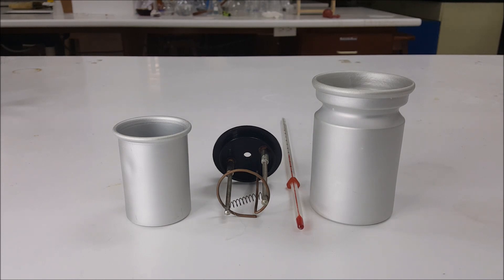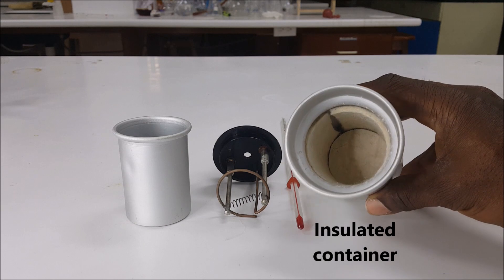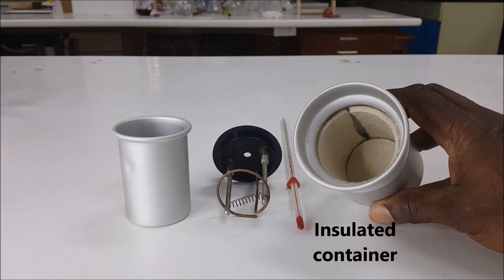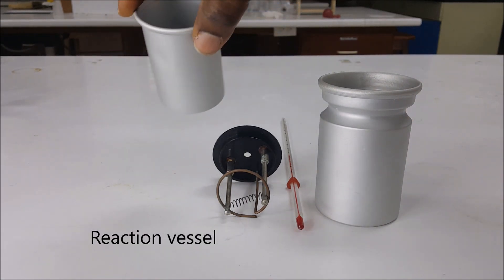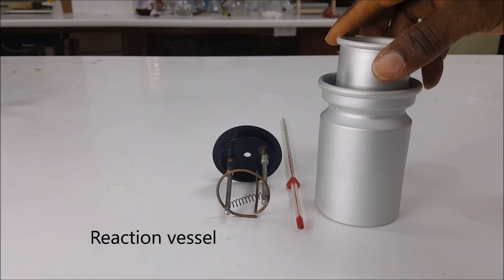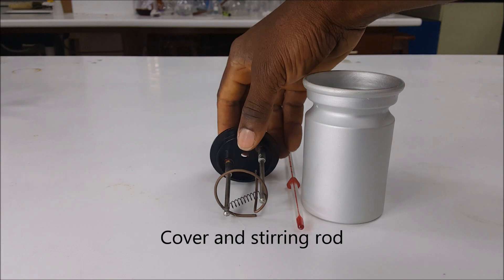A typical bomb calorimeter contains several parts. You have an outer insulated container that keeps the temperature and prevents heat from being lost too much to the atmosphere. You also have an inner vessel that is used to do your reaction in, and that fits in the insulated part.